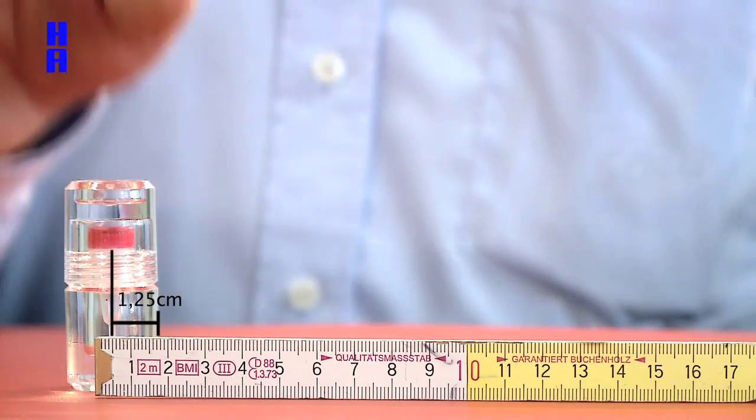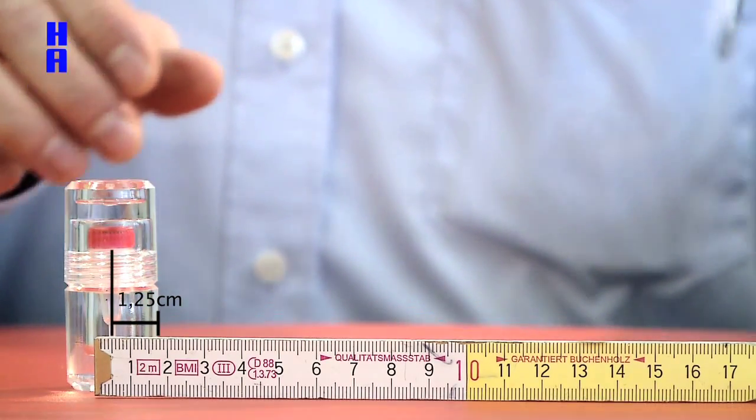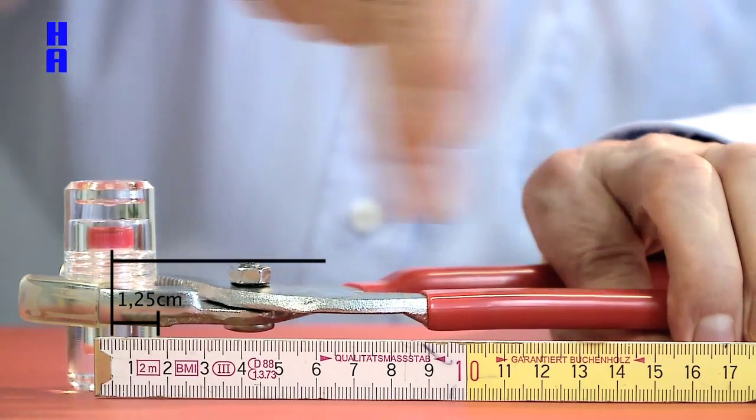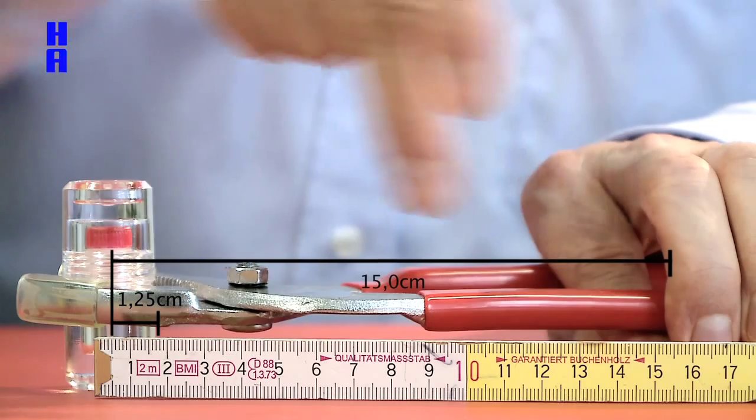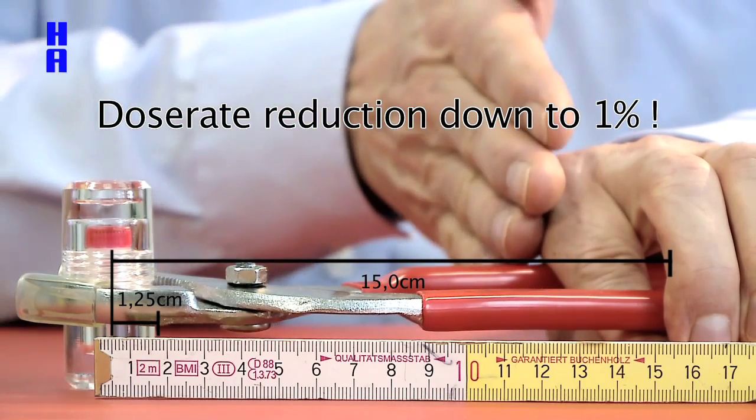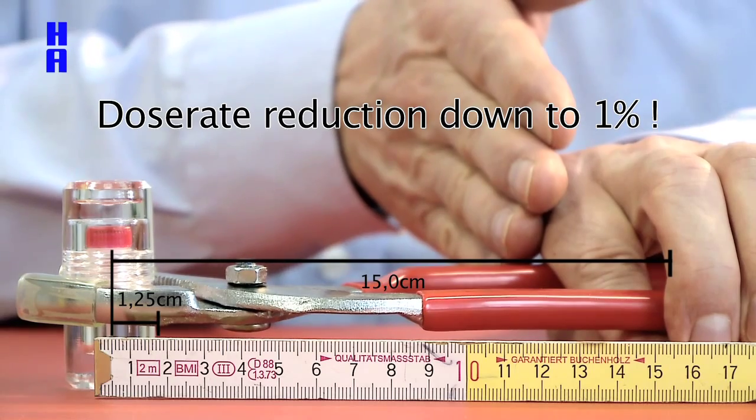If you want to reduce the dose to your hands, use a tool like this and the distance is enlarged up to about 15 cm, which reduces the dose rate onto your hands down to about 1%.